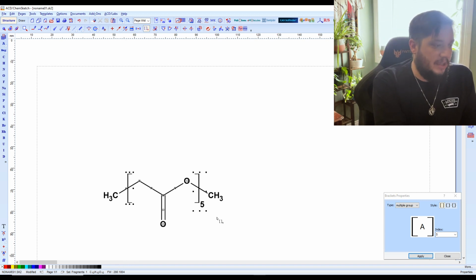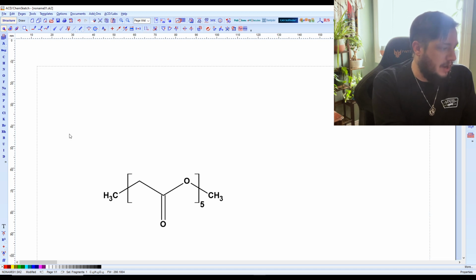Now the ends are not going to be properly taken care of there once we have that area selected, but once you unselect it, then it'll work properly, and you see the formula weight has actually changed. It's increased by 30 to incorporate both ends there.